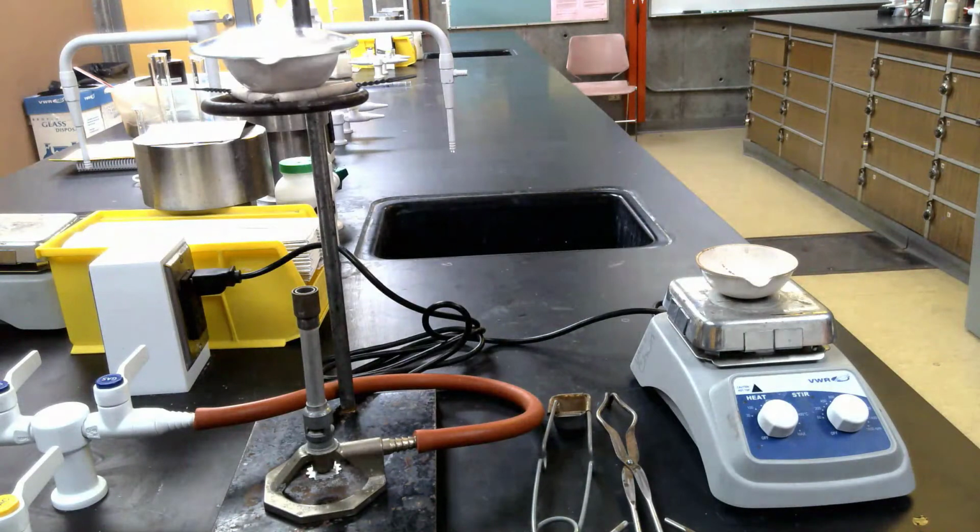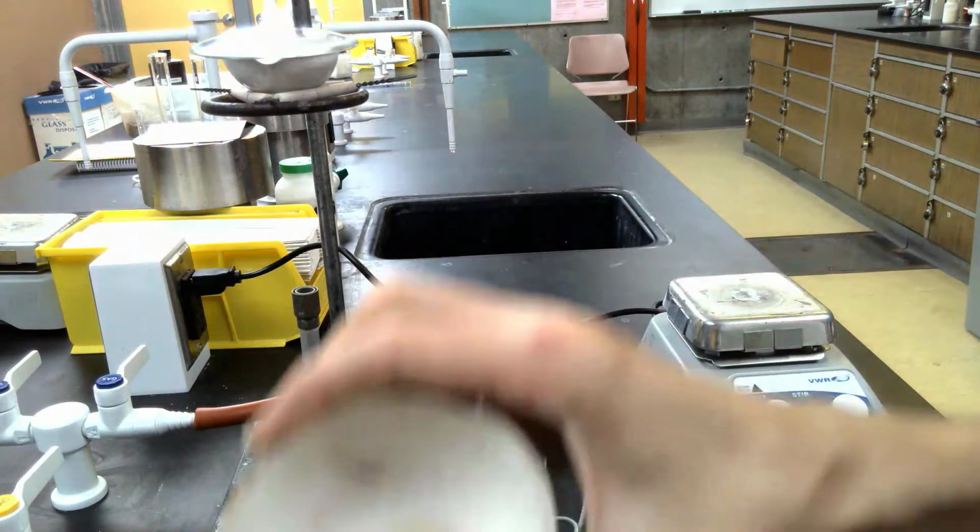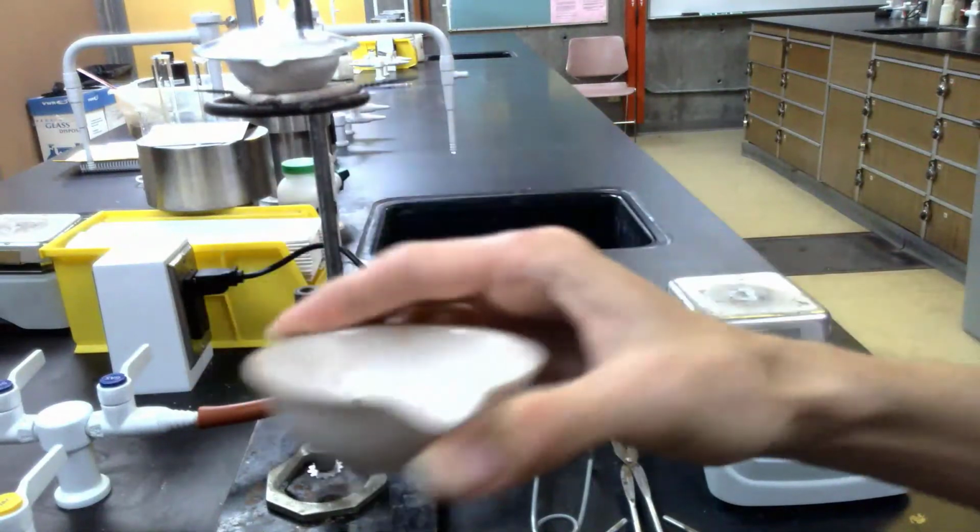A note about heating times real quick. So the sand, it's going to be easy for me to tell when the water has been totally evaporated because it's open to air. I can see inside of it pretty well. It's easy for me to tell.